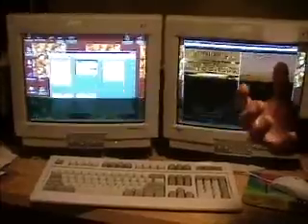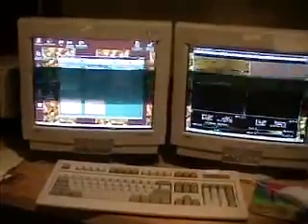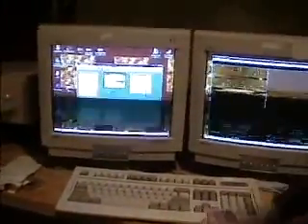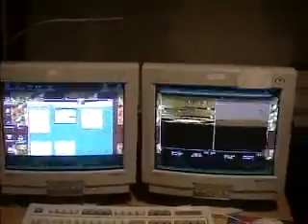So if you know that you're going to be imaging a very flat specimen, before you approach the sample you can type in a smaller value, let's say 2 microns, and that increases your Z resolution by roughly a factor of 3. It has a drawback that if you then run into something really big on the sample, you're going to crash your tip. So I would only bother to reduce this for the very flattest specimens like DNA on mica. So most of the time you can just leave that.